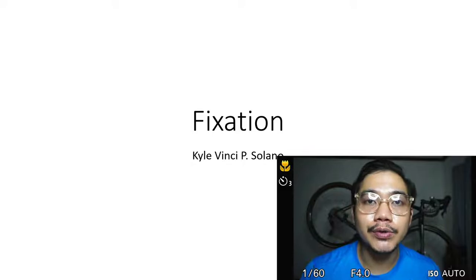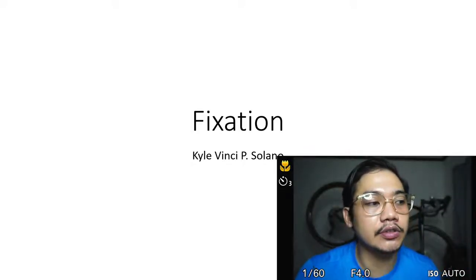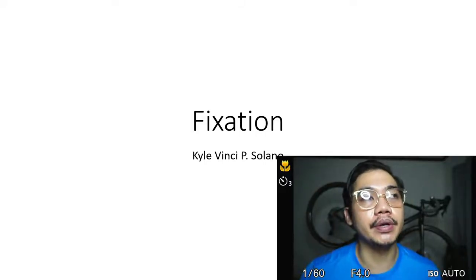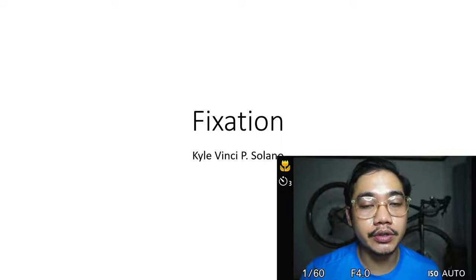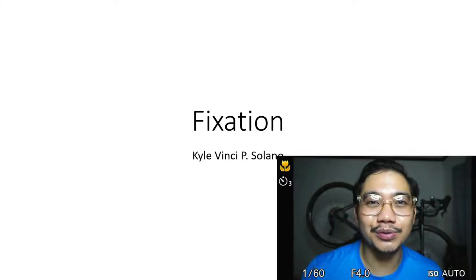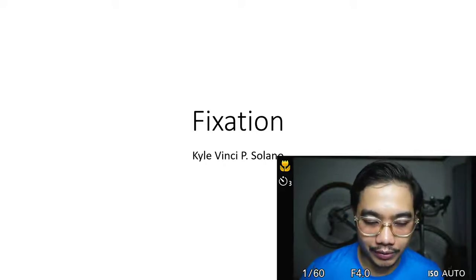That's why, if in the future you become doctors and you assist in surgeries, it is the job of the junior, maybe the junior medical intern, to put the specimen directly into the fixative. So it's one of the most important things, no? Okay, so next slide.